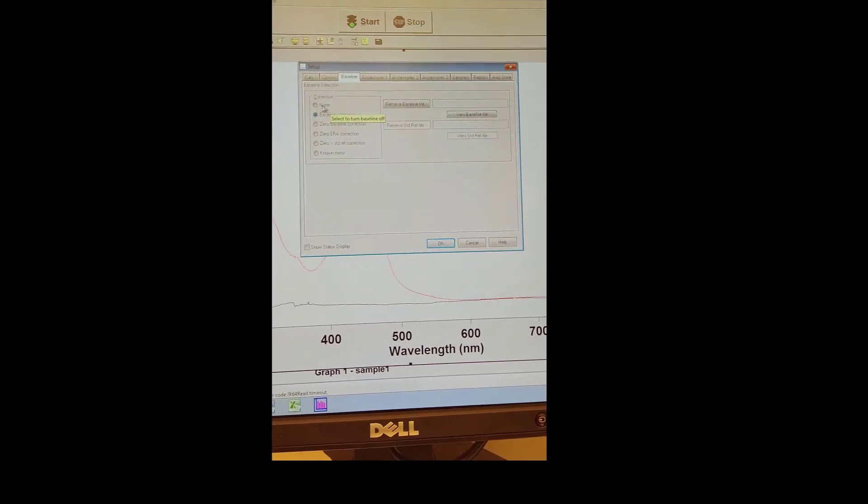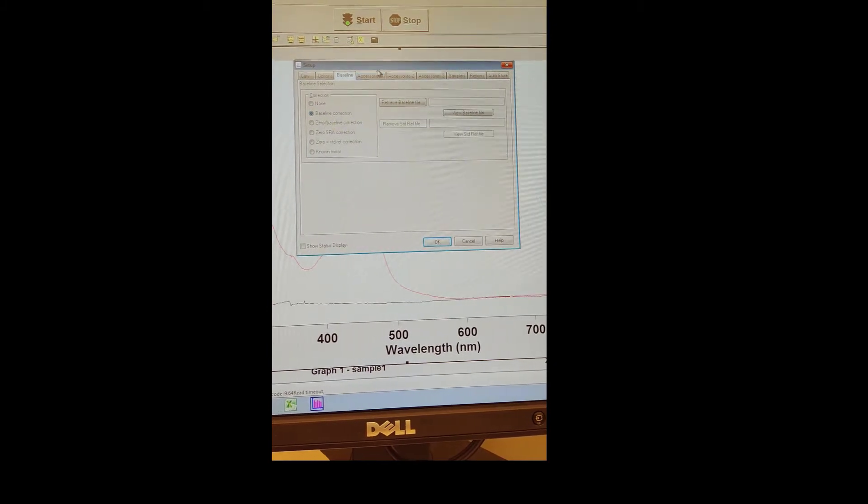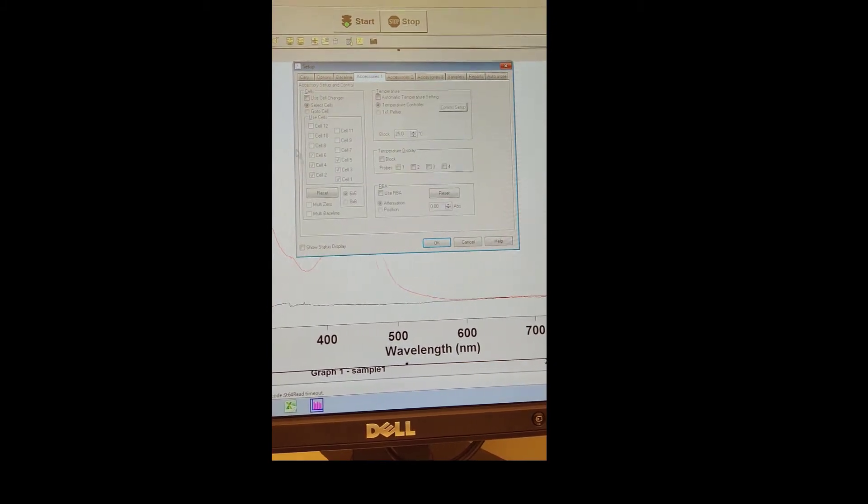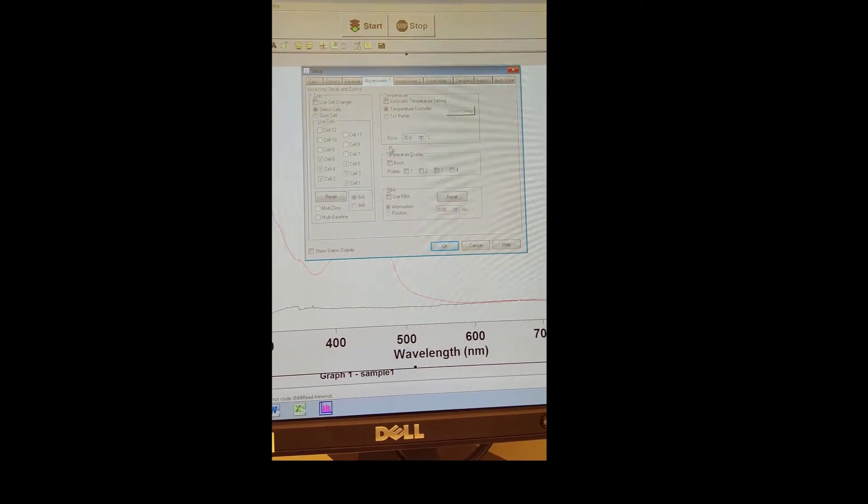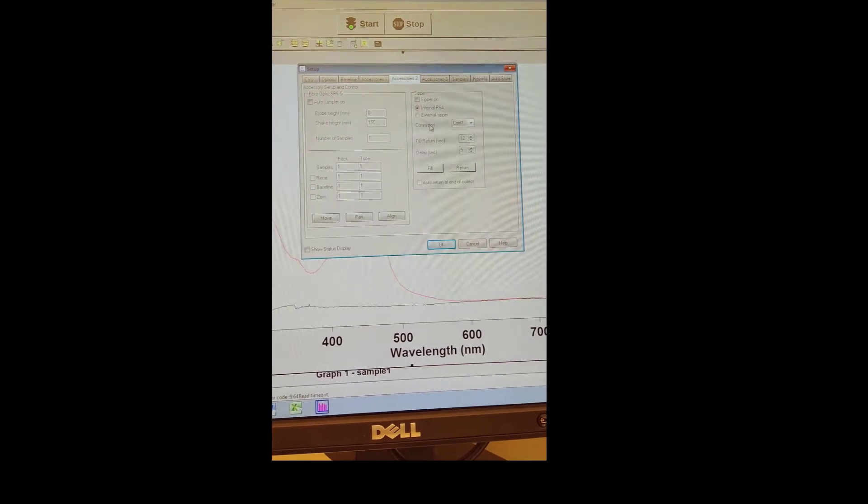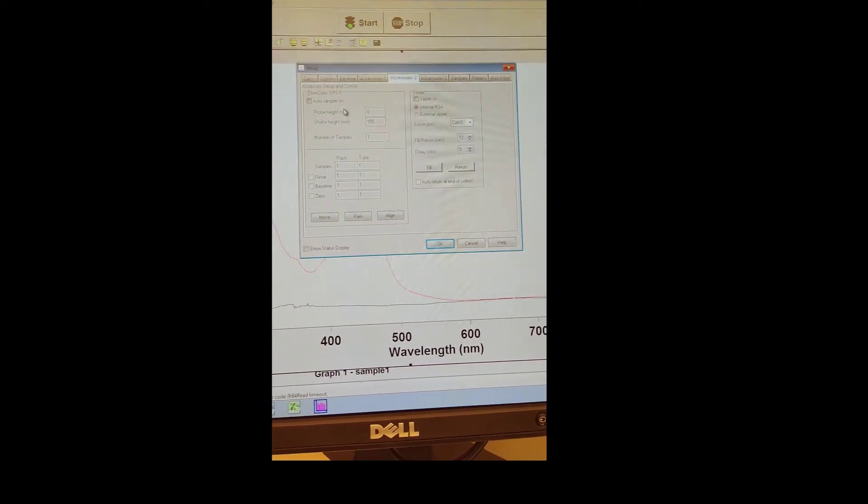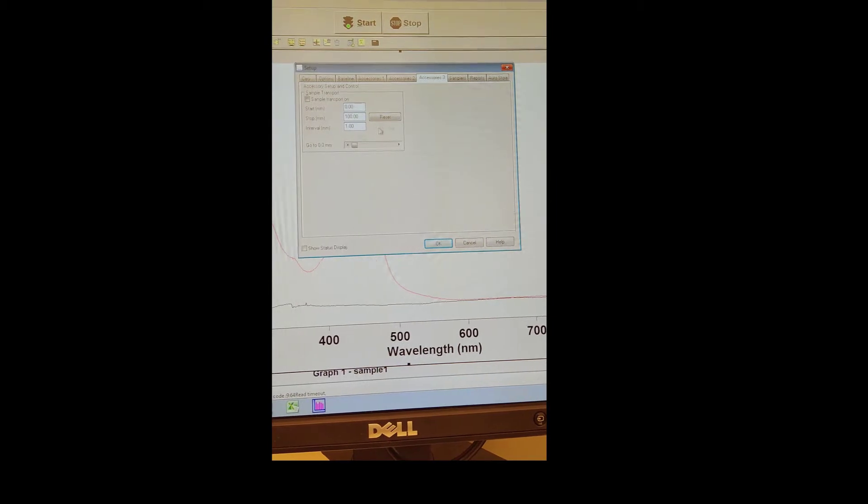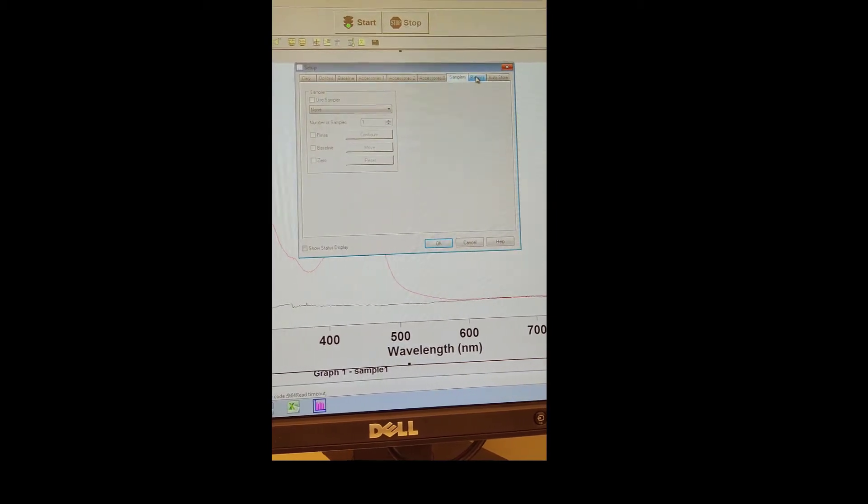Under Baseline, make sure Baseline Correction is selected. For Accessories 1, 2, and 3, make sure that nothing underneath those tabs is selected, because currently there are no accessories hooked up to the instrument.